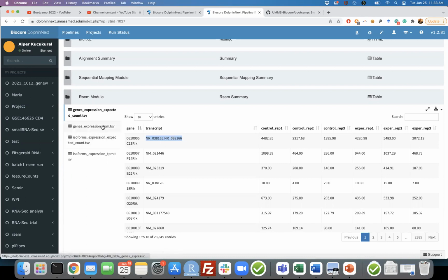So why do we do that? Usually we do DE analysis with these files, but when we do the visualization in the browser, we use normalized counts. First do your tests to find which genes are significantly different, for example, when you compare 2 different conditions, using your raw counts. And when you create your heat maps, use the normalized counts. We do this normalization after we do the test using that tool.